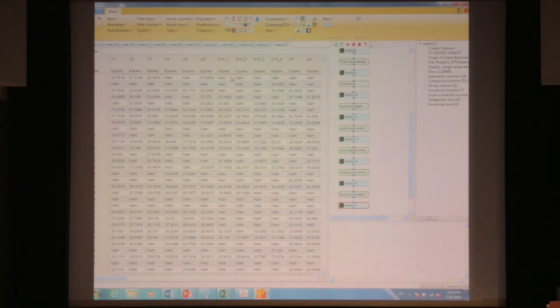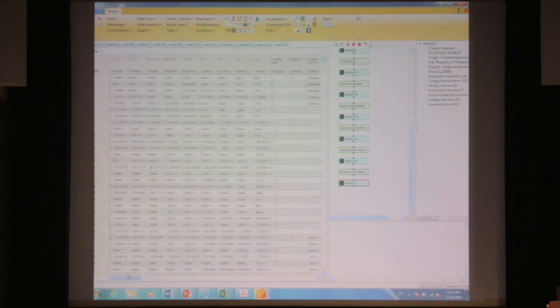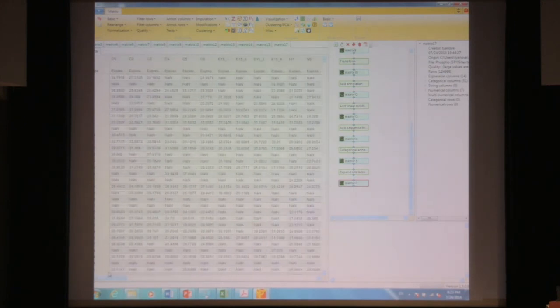Alright, so we just expanded the site table. And that took a while.